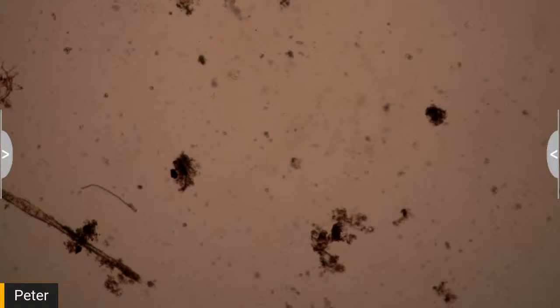There's the edge. There's the edge, alright. Edge to edge. There's my little flailing tardigrade. Alright, let's go in the middle. Down. Where are you? There you go.